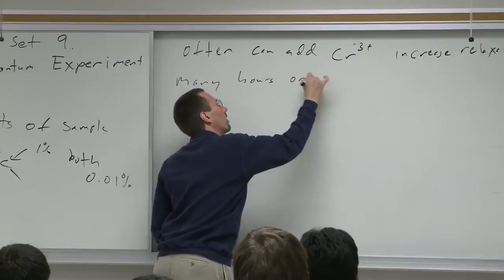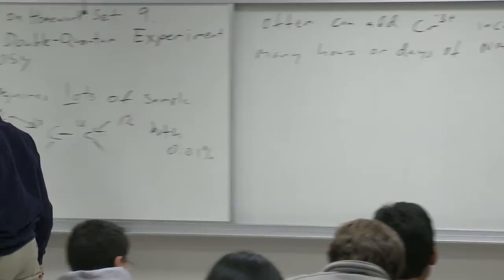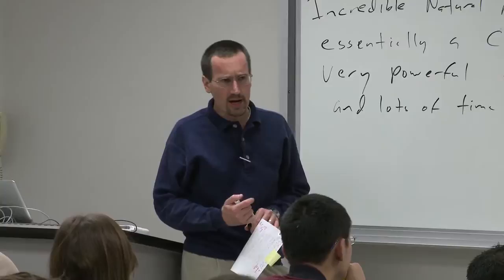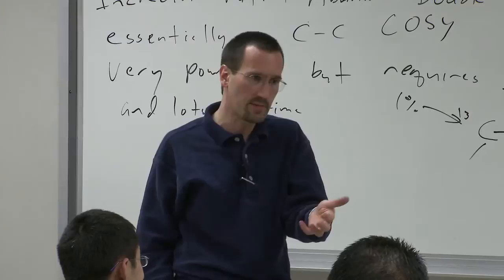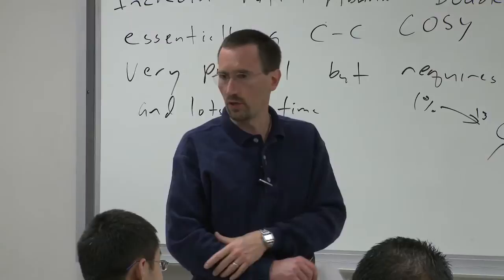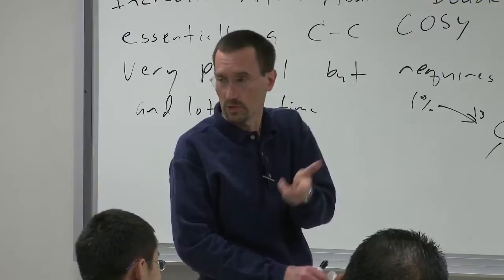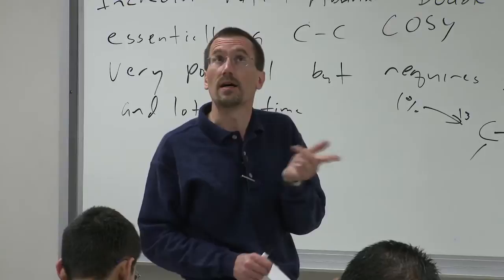Now, I will say this, the cryo probe, we haven't really sat down and tried this with the cryo probe. Maybe Phil has, maybe somebody has. So the cryo probe instrument is super sensitive because you're cooling the coil in the probe and reducing the amount of noise. It's not increasing the amount of signal, but if you reduce the amount of noise, you increase the signal to noise ratio. The cryo probe is like 5 times or 10 times more sensitive than a traditional probe, let's say 5 times. So that's going to buy you a lot, because remember, 5 times more signal to noise can translate to cutting your experiment time down by 25. I'm sorry, no, 5 times will cut it down by 5. But that can still help you out.